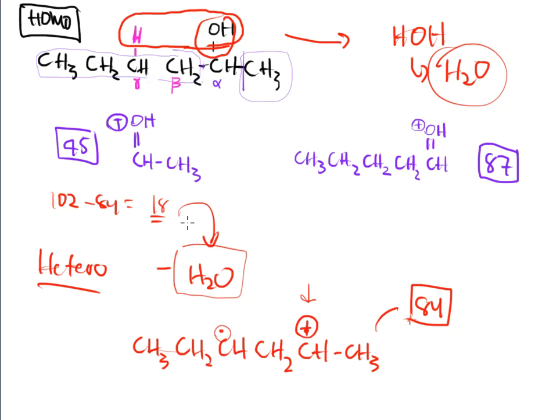Every time we've seen 15, it's been a carbon and 3 hydrogens that are tagged along, right? Well, 18 is very particular. 18 is typically assigned to a water molecule. It's a very good indication that I have OH in my compound when I begin to look at the mass spectrum of the compound itself.